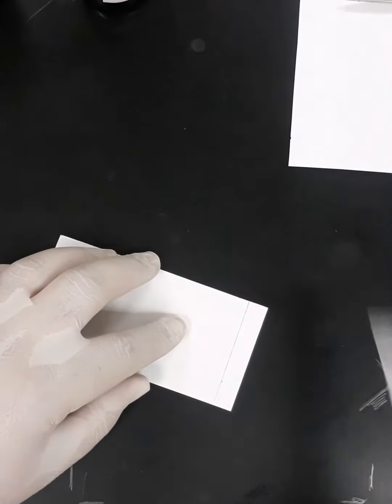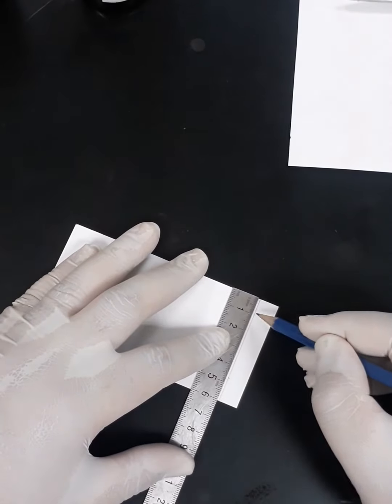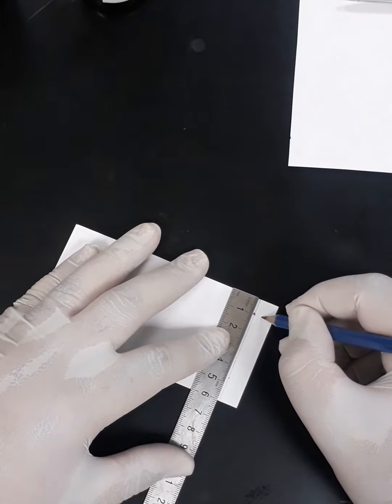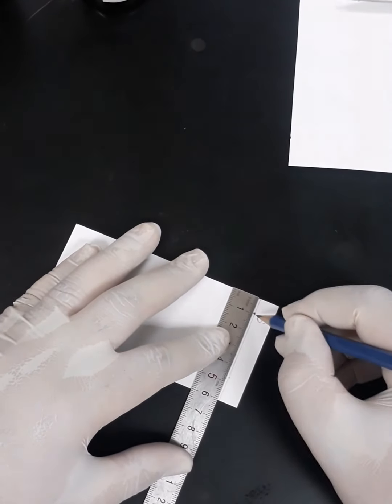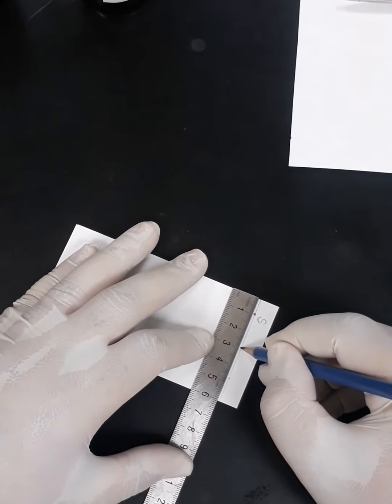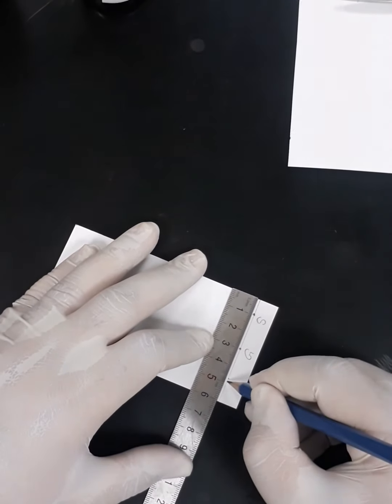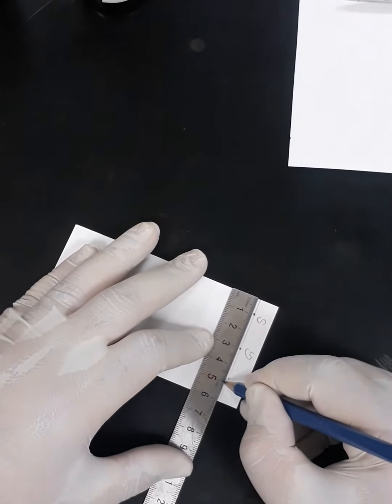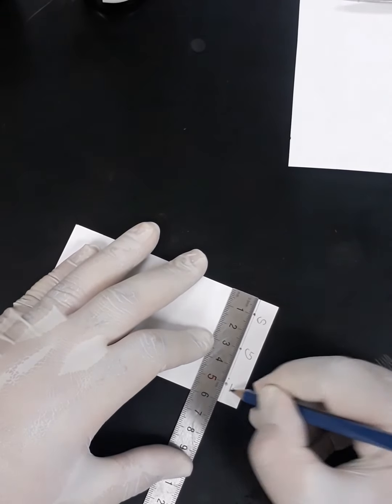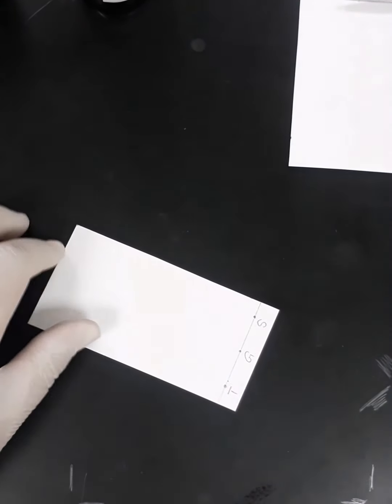So now we are going to equalize where we are going to put the spots. We said 1 centimeter from the wall here. So here would be the first spot, and I will call this spot the sample, so I will call it S. Now this is the second spot. We have to keep 2 centimeters. So here would be the second spot, and I will call it the glycine spot. And here would be the third, at 5 centimeters, so I have to keep 2 centimeters. So here it would be the tyrosine, and then 1 centimeter from that spot to the wall. So now we are ready.